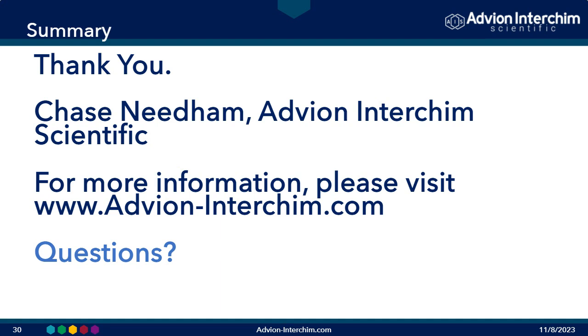Great. All right, it looks like we have time for one more question here, so we'll wrap up after this one. This question asks, can I use the Plate Express with C18 TLC plate? Yes, so you can use the Plate Express with just about any media that's available on a TLC plate. C18 is very common. You can also use it with alumina or an amino bonded phase, really any TLC plate you have.